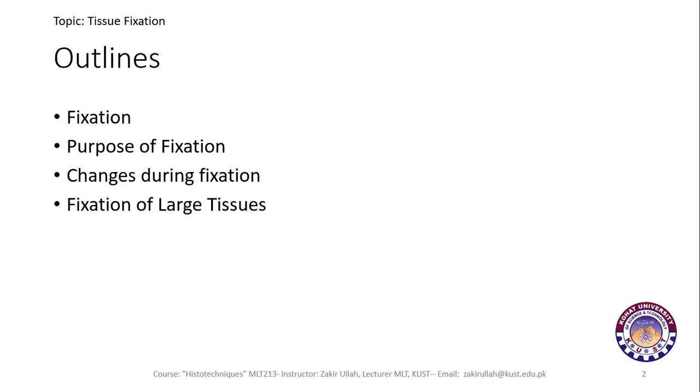And we will also discuss the fixation of large tissues, when a tissue is larger than the normal tissues, and also certain special tissues, for example brain or small biopsy type tissues.